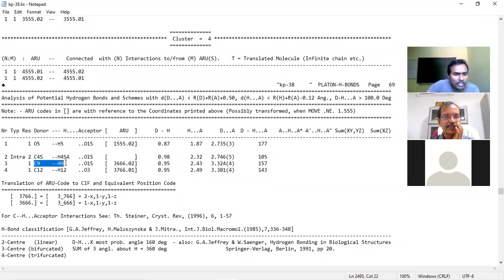And this also we can find out. This also, similarly, you can find out, this also C9, H9, because this can be considered. Because these are non-classical hydrogen bonds. This will be somewhat weaker than this one. So it is obvious. So we can say in addition to the classical hydrogen bond interaction, we have non-classical hydrogen bond interaction additionally supporting the assembly of this crystal.